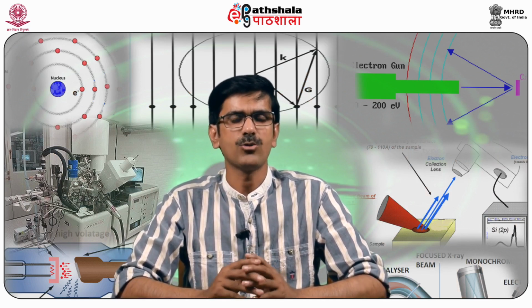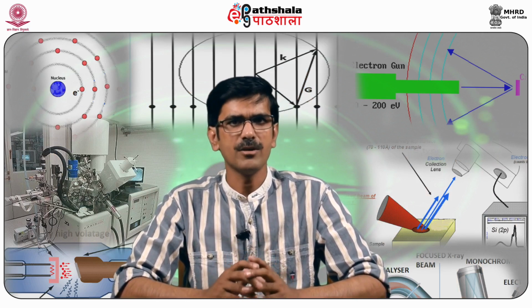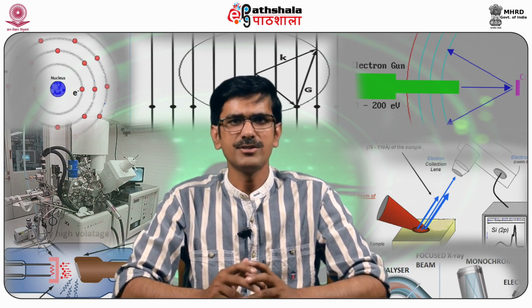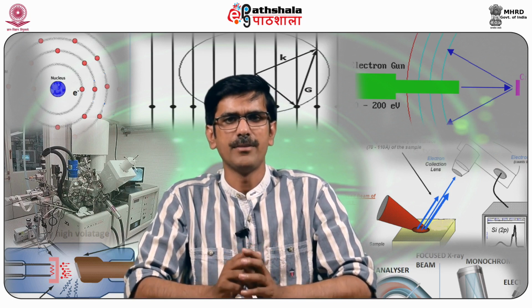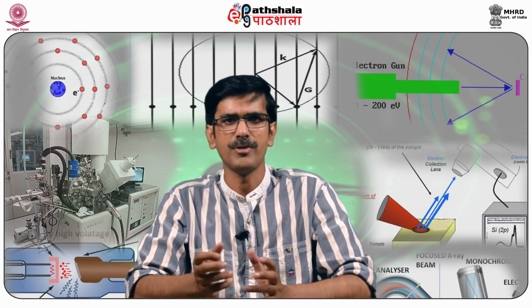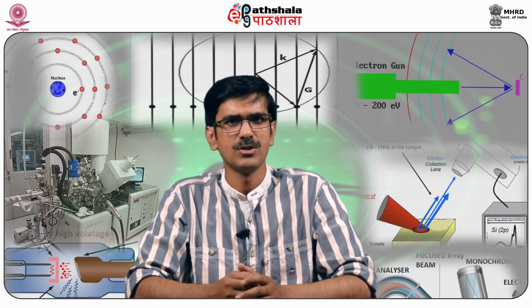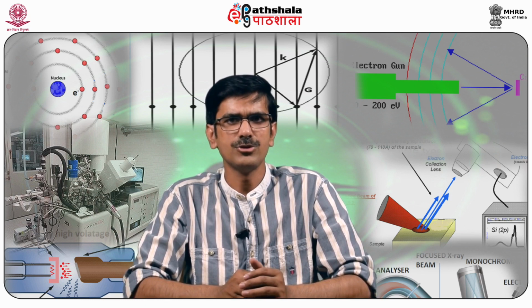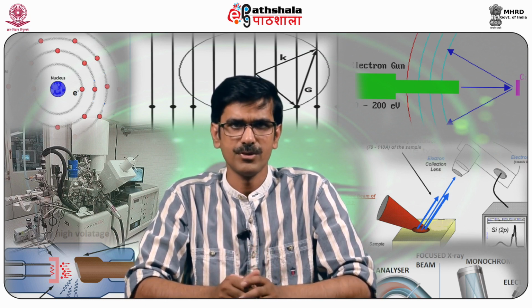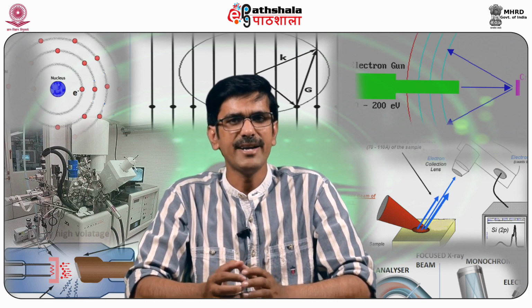EDX is a qualitative and quantitative X-ray analytical technique that provides information on the chemical composition of a sample. It involves the generation of an X-ray spectrum from the integrated scan area of the SEM, scanning electron microscope, or the micrograph. There are certain energy constraints which are used in this analysis. Now, what is an energy constraint? It means something that controls you by keeping within particular limits. This means we will study the energy limitations that we have to keep in mind while dealing with the EDX system.